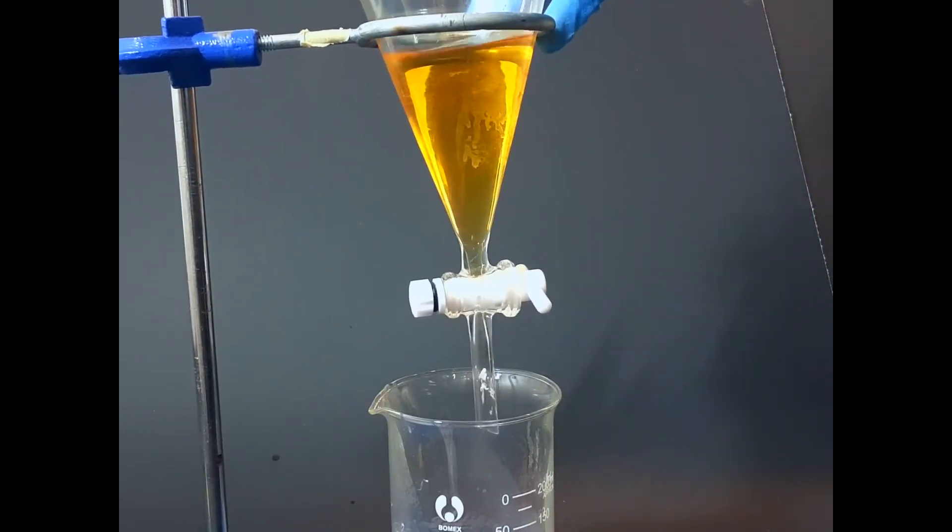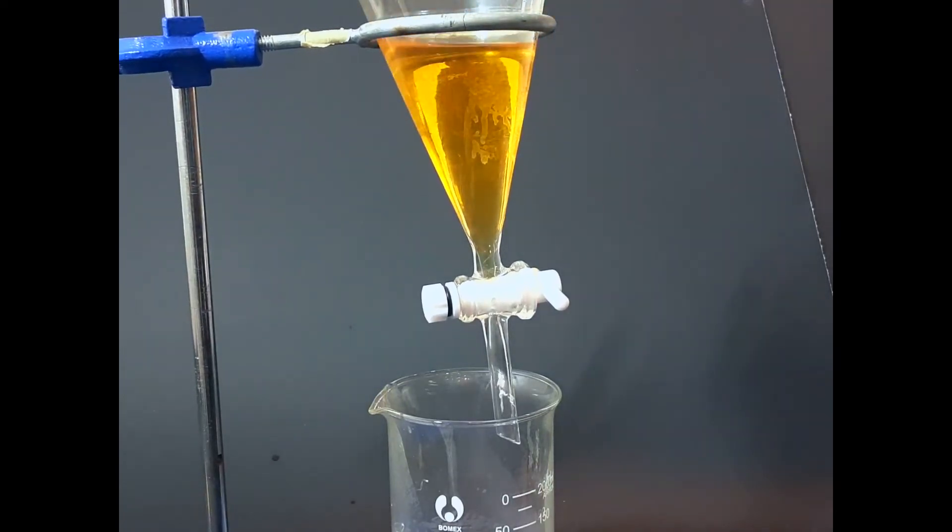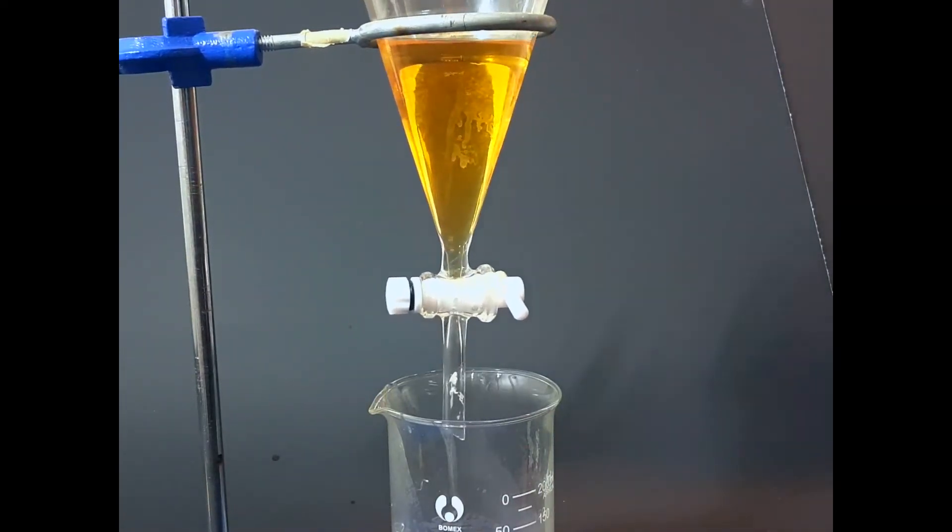Now, in order not to form an emulsion with the DCM and to make sure it separates nicely, I don't need to shake it a lot. All I need to do is just pour it back and forth to make sure that everything is nice and dissolved.